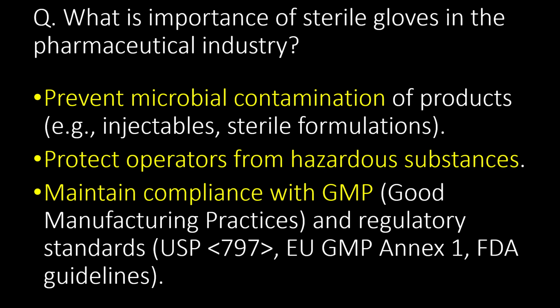First, to prevent microbial contamination of products. Secondly, protect operators from hazardous substances. And third point, maintain compliance with GMP, that is good manufacturing practices, and regulatory standards like USP chapter 797, EU GMP Annex 1 and FDA guidelines.